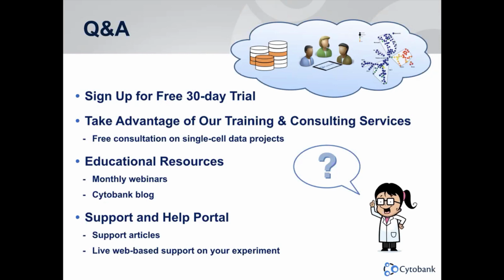Yeah, exactly. Thank you for answering that question. So actually in Cytobank, when you set up Citrus, you're able to identify the smallest cluster you're going to define. So you could set up a few, then you can run them simultaneously and check on the results that way too.